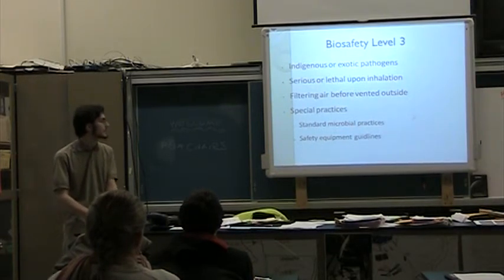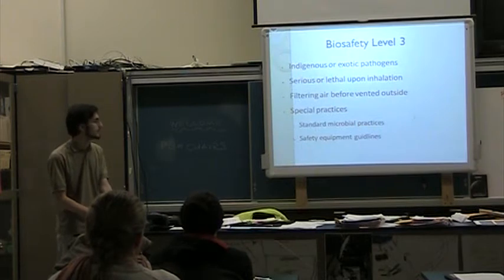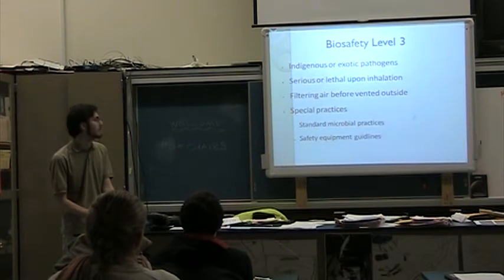So they have special practices in these labs where you get the standard microbial practices, which involve all the disinfectant stuff, as I said before, in the safety equipment guidelines, which are really, really strict about wearing all the equipment that protects you from infection while in the lab.